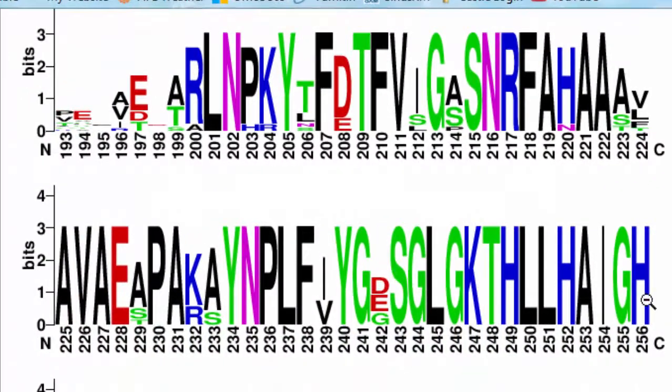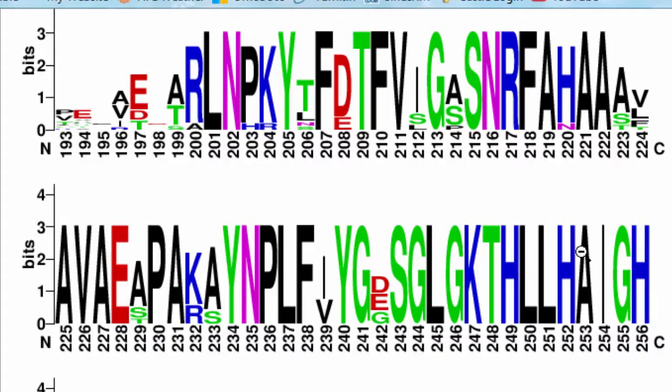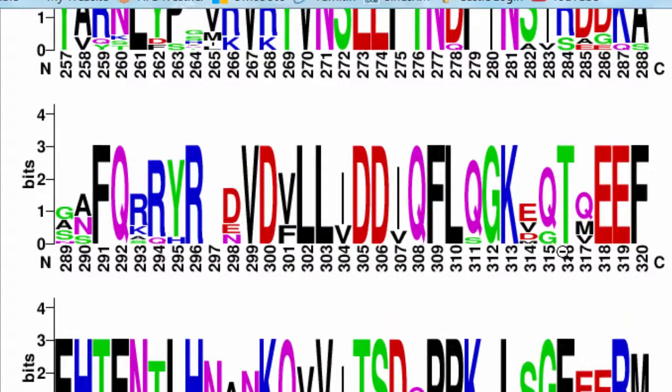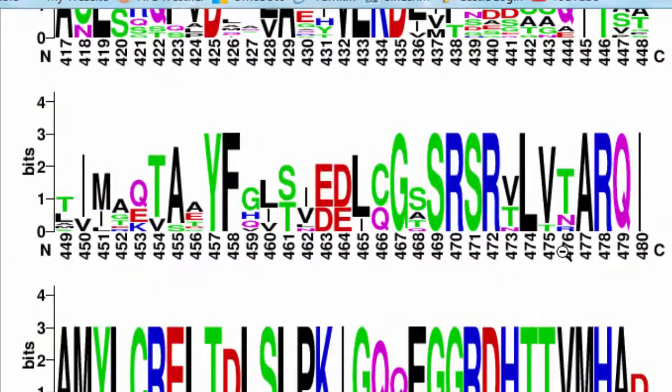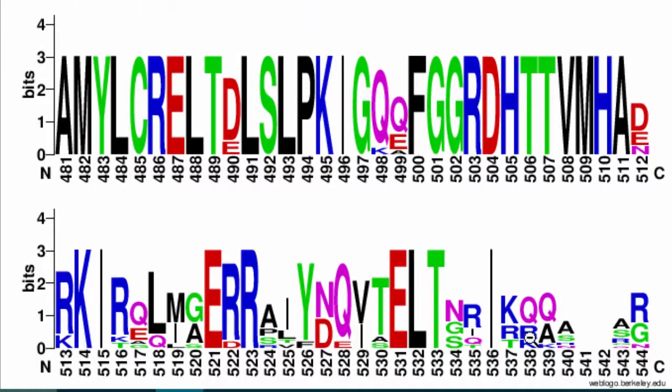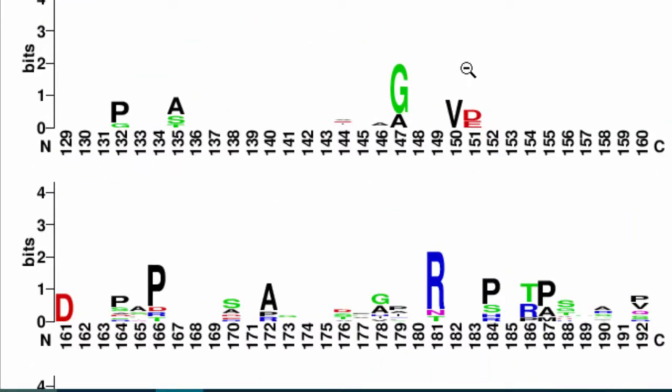The height of the stack tells how conserved that position was. So when we see all of these tall single letters, that means that's really well conserved across the 11 bacteria. If we scroll down, you're going to see that not all places have a letter there at all.